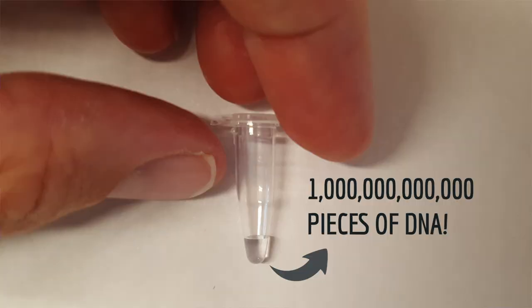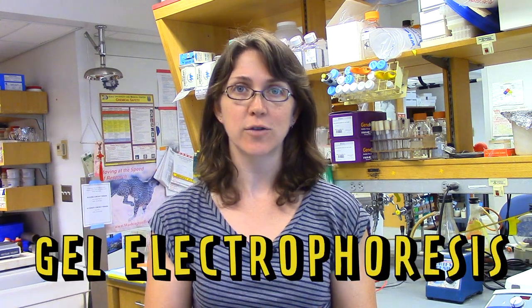So, the researchers need a way to see whether the pieces of DNA in here are long or short. But the problem is, the DNA is tiny. This little tube has one trillion pieces of DNA in it. I can't see them by eye. I can't even see them with a light microscope. So I need a way to see whether the pieces of DNA in this tube are long or short. And the cheap and easy way to do that is gel electrophoresis.